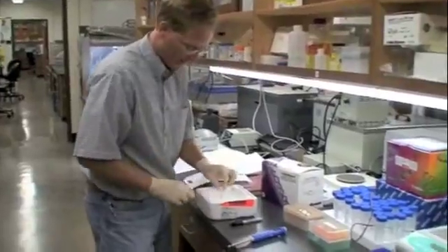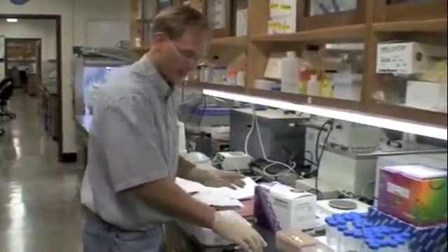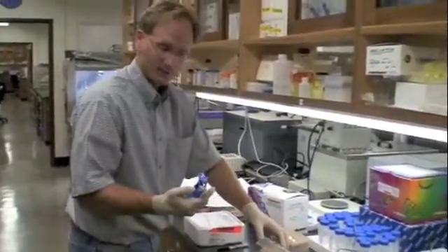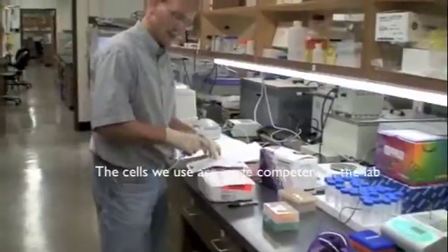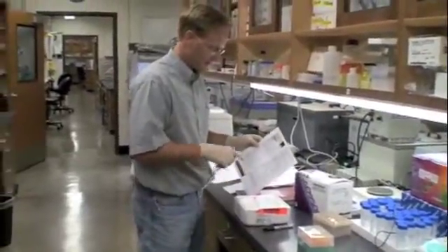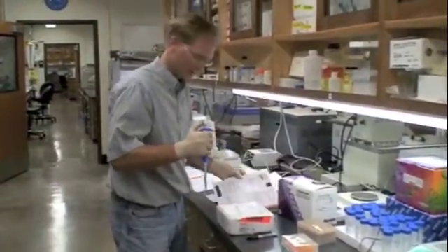I've taken the cells out from the minus 80 and they've just finished thawing. I've got ice in here — I placed water in there, so it's more of an ice bath than just straight ice. I'm following the protocol for these particular cells. These competent cells that I've ordered come with a protocol sheet from New England BioLabs — the five alpha cells.